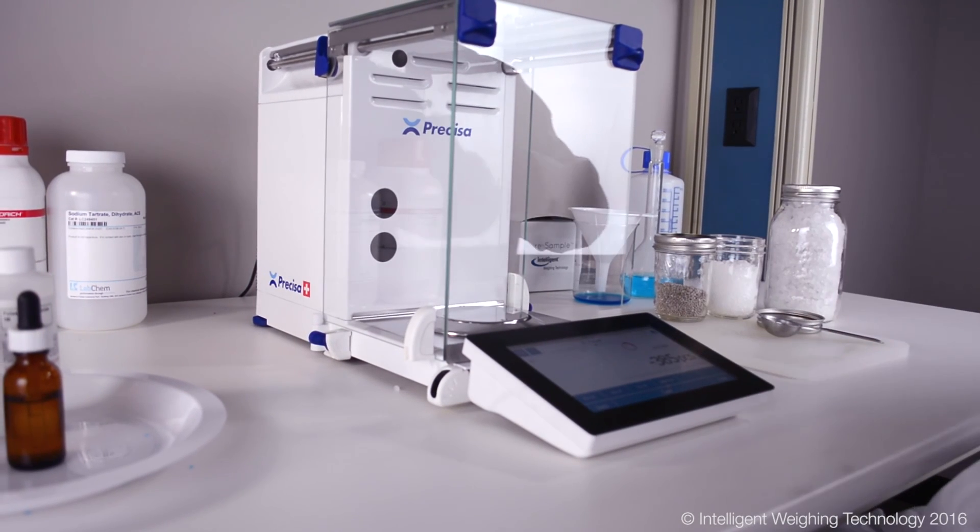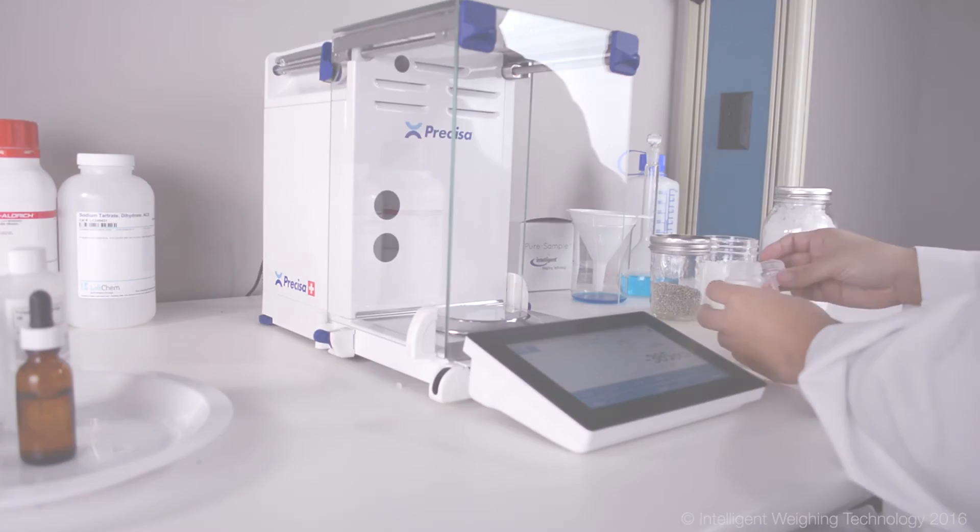Reading the manual is a thing of the past. Let your balance work for you so you can continue exploring science.